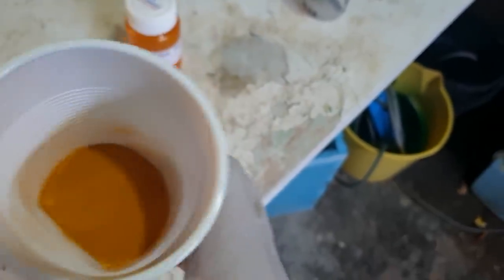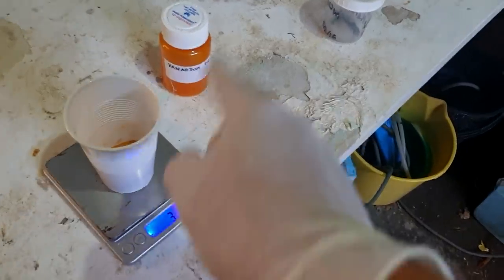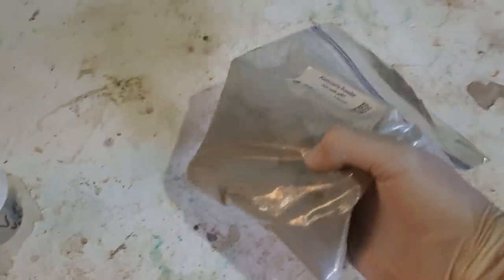Pretty much all vanadium chemistry ends up being very nice, pretty colors. It's not yellow — it's a nice orange color. So let's use 20 grams today. This is my trusty aluminium powder.